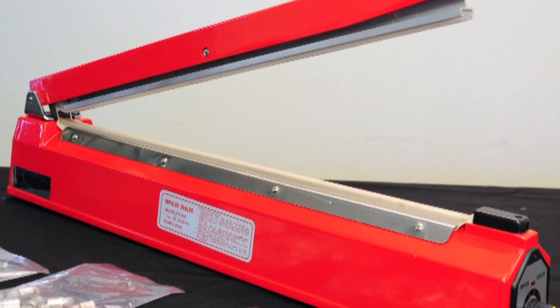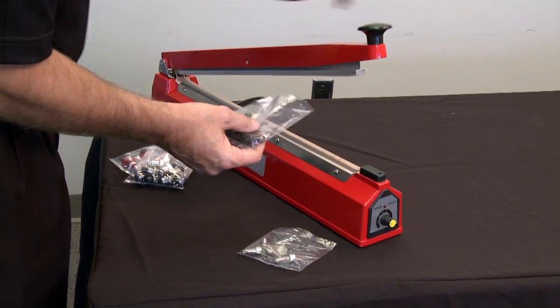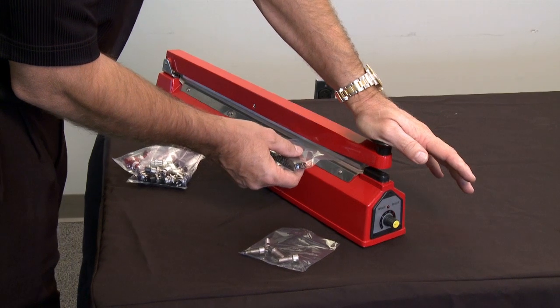With three models to choose from — 8, 12 and 16 inches — Impulse Heat Sealers are the versatile sealer to meet your company's needs.